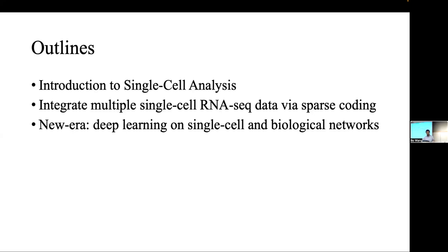First, I will give a brief introduction about what is single cell analysis, and then I will talk about our first machine learning, traditional machine learning based, specifically sparse coding based machine learning algorithm to integrate different batches of single cell RNA-seq data. And then I will go further, talk about some of the application of deep learning in single cell and biological networks.